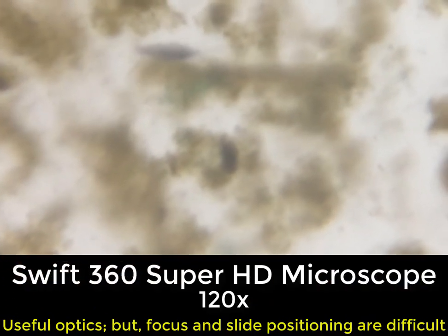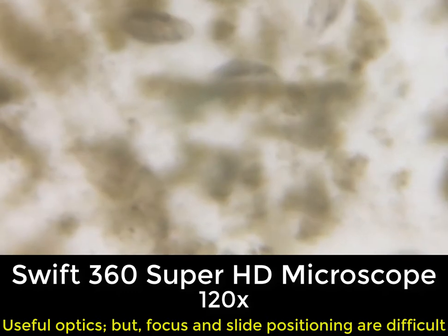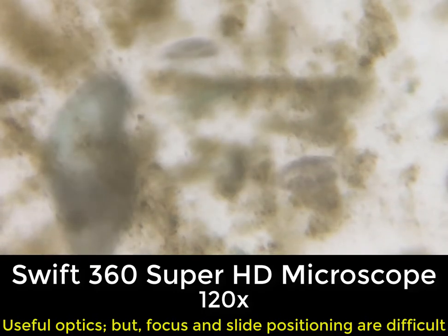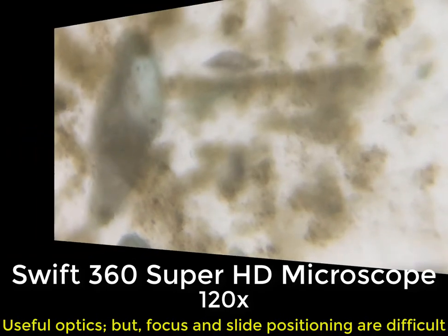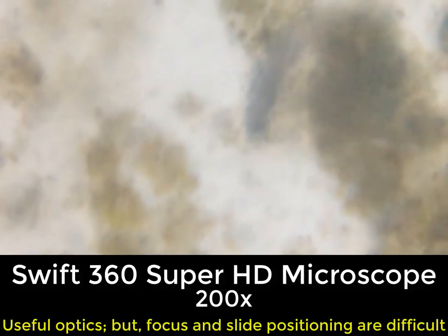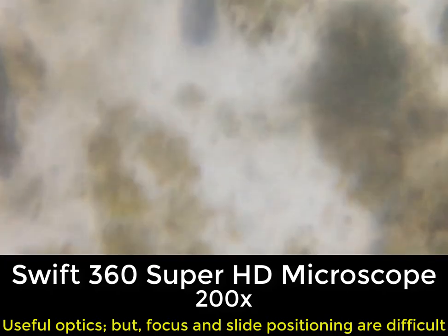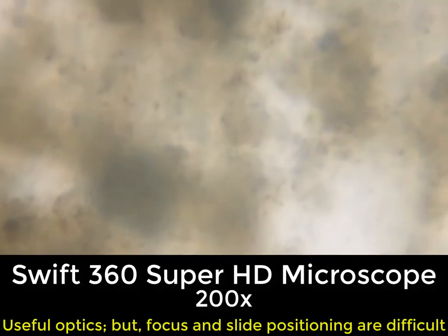We are now at 120 power, and as you can see, it takes a little while to get anything close to really focused. The optics aren't terrible, but chasing down focus can be a bit frustrating. What's really frustrating is when we have to try to move and follow these protozoa. At 200 power, things really get difficult. We can zoom in and out using our fingers, but focusing is the real issue. And obviously, now that we're at a higher power, moving the slide around at all becomes very difficult.